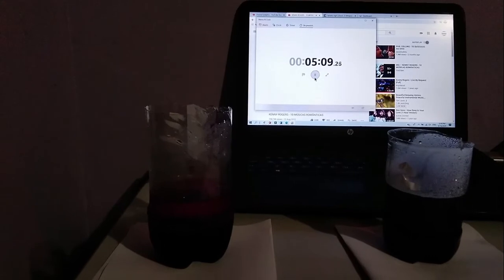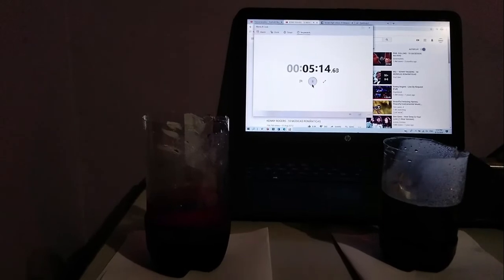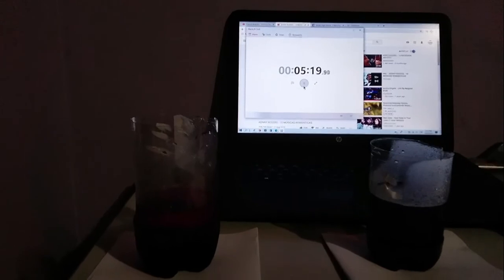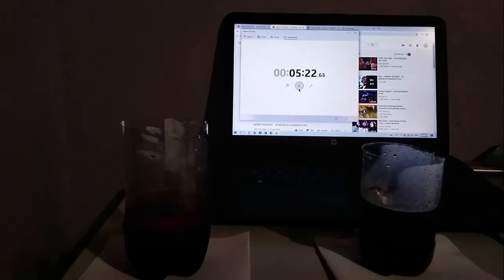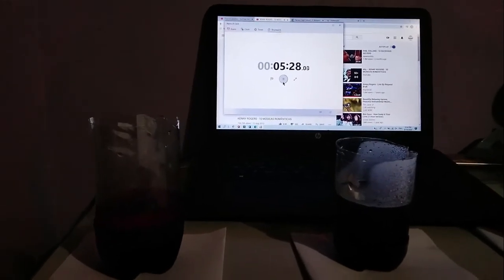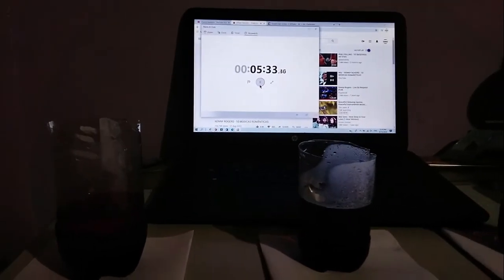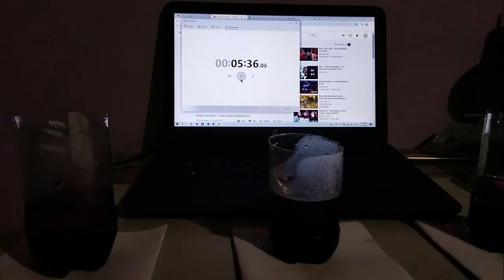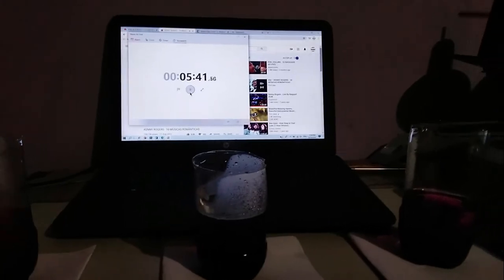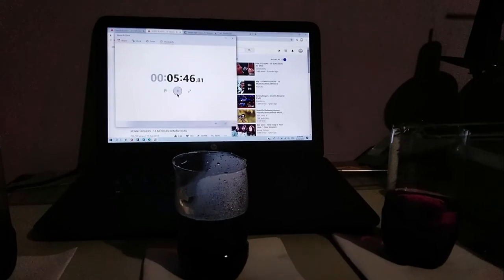Right, so we have used a beaker. We're using some modified beaker. We've used a measuring cylinder. Of course, we use a balance to find the mass of the potassium permanganate. I'll soon tell you that. And we have used a spatula to actually get the potassium permanganate onto the paper. And of course, we use the microwave to heat up the water, and we had to use the refrigerator to lower the temperature of the water. And we just got specimen C from the pipe. And you remember it is at 28 degrees Celsius.